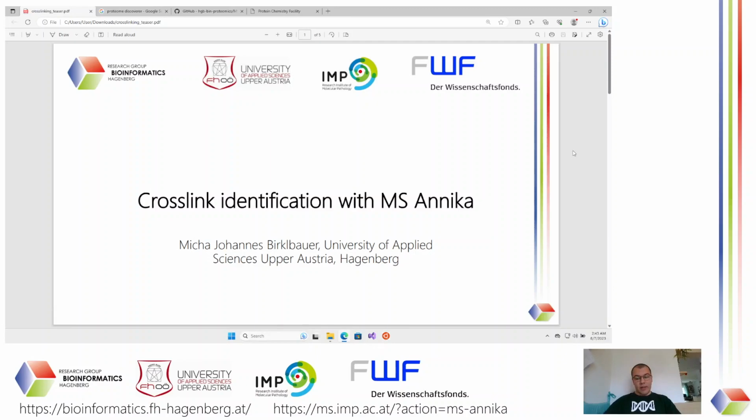I'm one of the main developers of MS Annika, which is a cross-linking search engine, and I'm going to give you a complete walkthrough of how we can use MS Annika to do cross-link identification from MS spectrometry data.